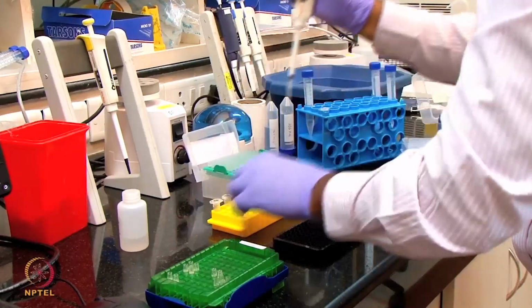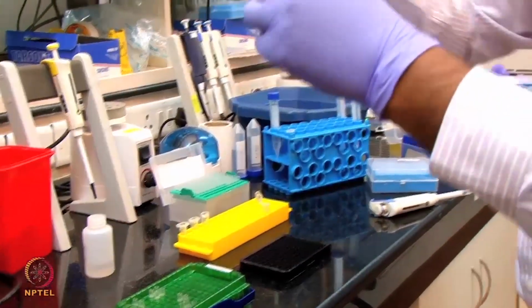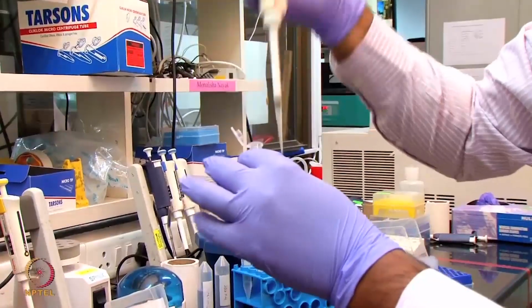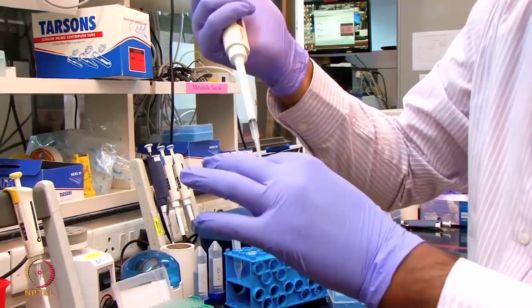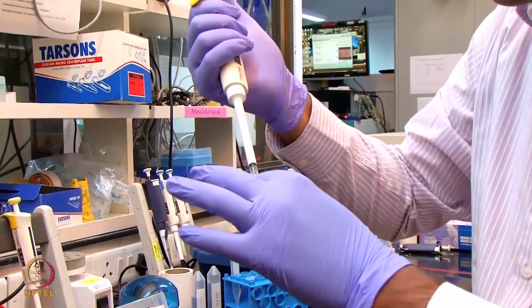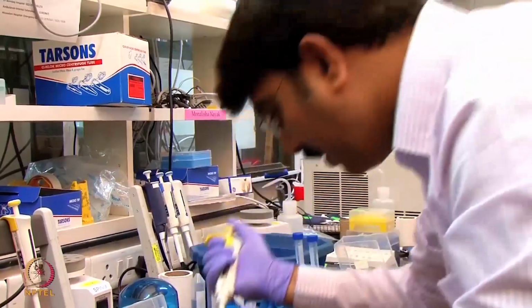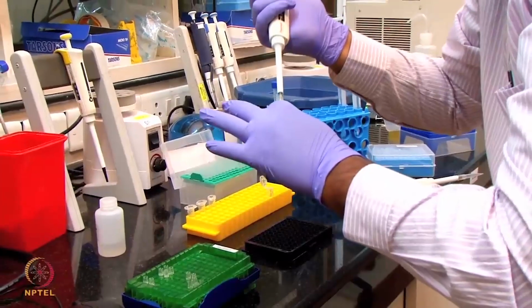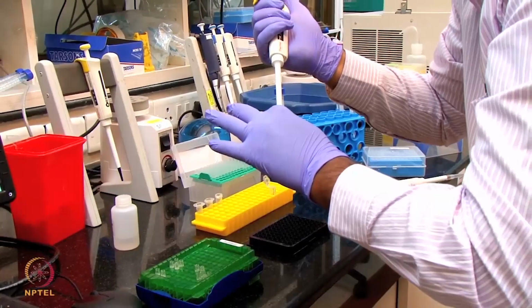Now I am adding the biotinylated anti-apolipoprotein, 200 microliter of each to the 96 well plate.